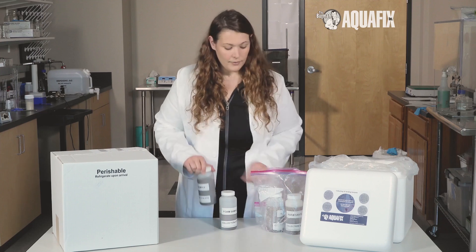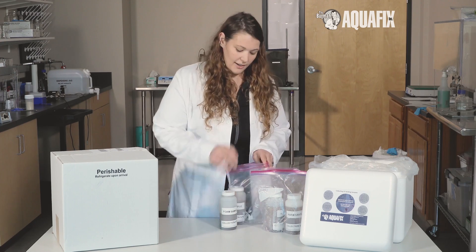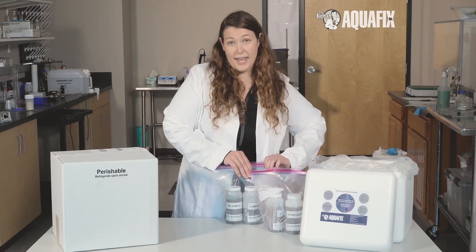Twist the tops tight and place the bottles within the provided resealable bag, making sure they remain upright and expelling excess air. Make sure that the bag is sealed shut.